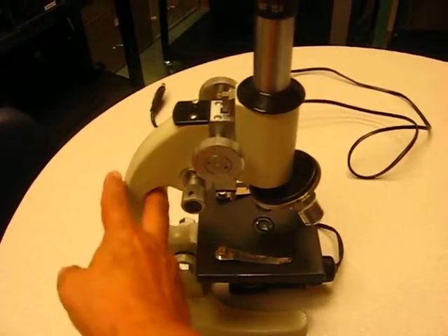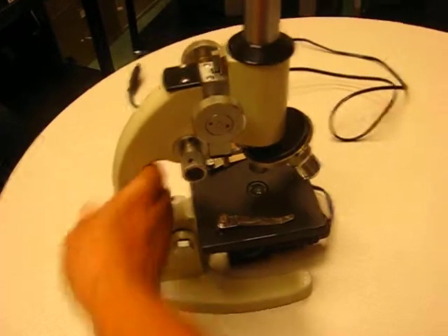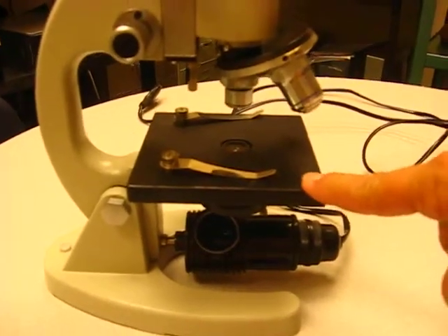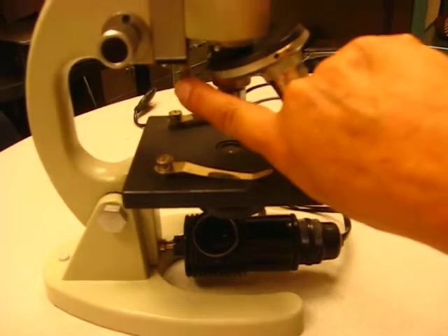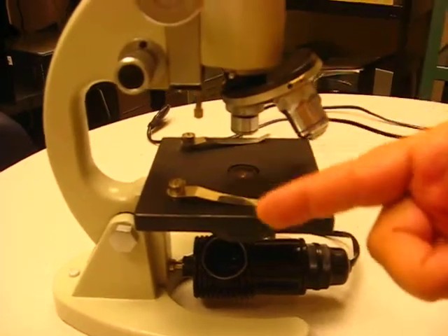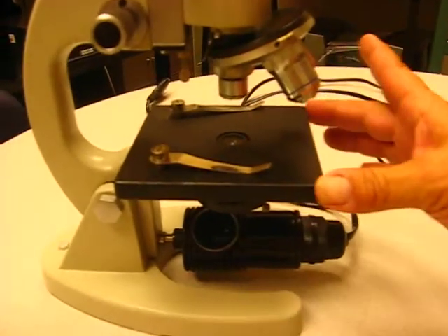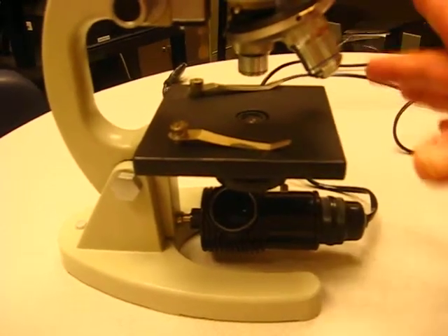This is the arm and the base, and this is how you would carry the microscope — grasp one hand around the arm and the other hand underneath the base to carry it safely. The next thing you have is the stage; this is where the slide with the specimen goes. These are the stage clips to hold the slide in place. This little screw is a stop screw that keeps you from lowering the stage too far and breaking the lens, which could be a safety hazard. On many microscopes the stage will adjust back and forth so you can bring your specimen into the field of view.